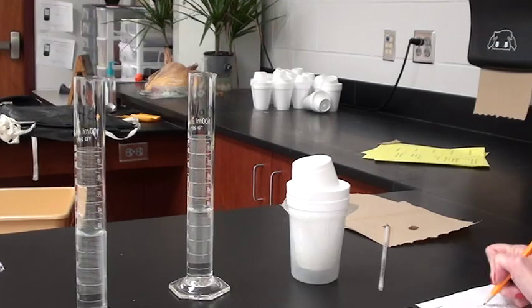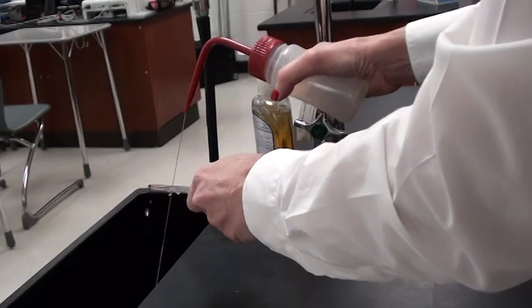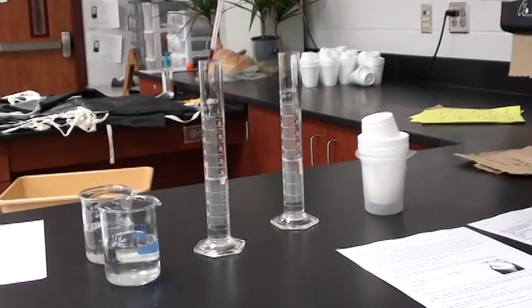Now I will get the NaOH off of the thermometer by rinsing it with water. I will dry it. Now I will take the temperature of the HCl.